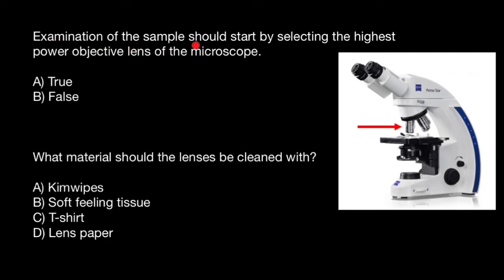Examination of the sample should start by selecting the highest power objective lens of the microscope. Is it true or false? It is a false statement because we should use the lowest power objective lenses when we start working with a sample, and then we can switch to high power objective lenses followed by fine adjustment. So this is a false statement.